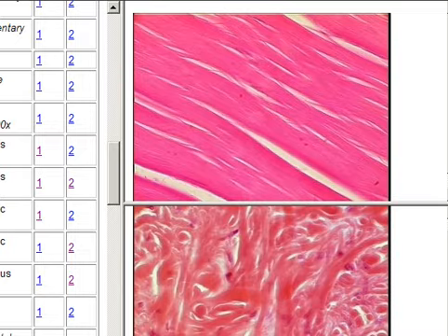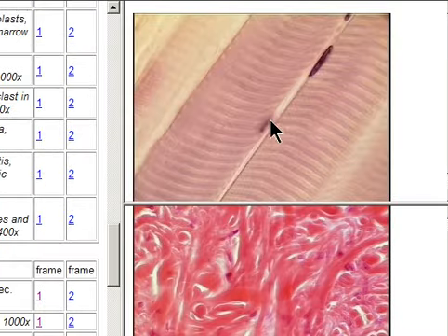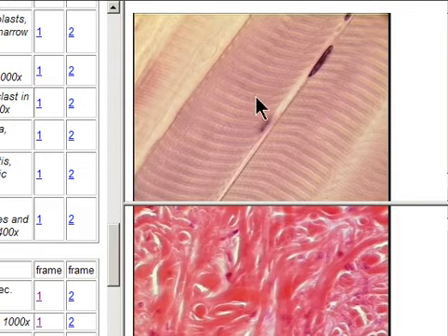And just to show you skeletal muscle, so here is skeletal muscle. Of course this is a very magnified picture that you see over here, but you can see striations and these nuclei just below the cytoplasm, just below the sarcolemma. So that's called hypolemmal nucleus.